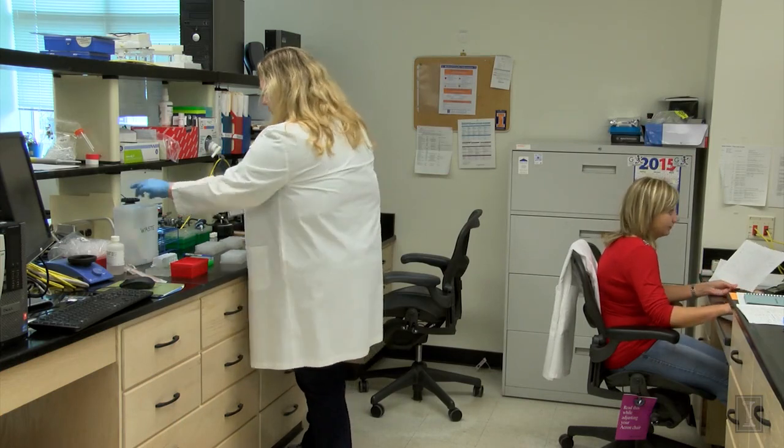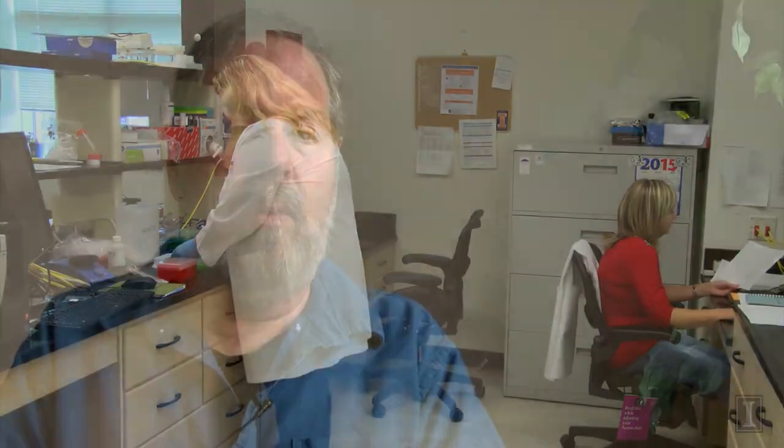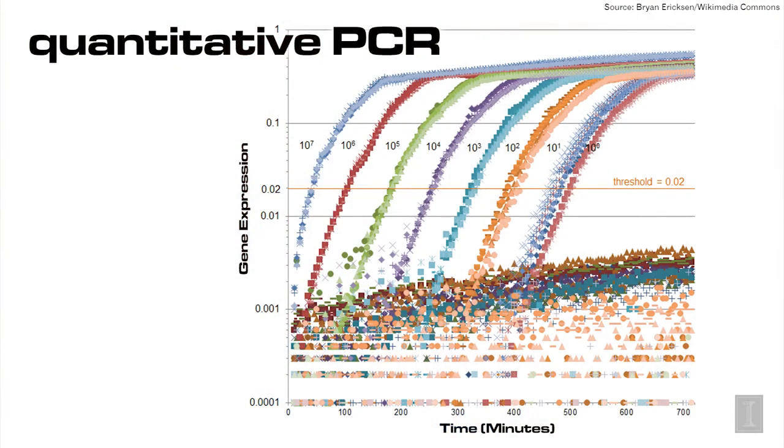A lot of the technological developments, first of all, there are new processes, and there are processes that are on a much higher throughput basis. One of the things that we're doing now, quantitative PCR, where we used to look at individual reactions in a 96-well plate for 96 or 384 reactions at a time. Today we have technologies that can look at multiple genes for multiple samples. So we have instruments that can do up to 9,200 reactions in 2 hours.